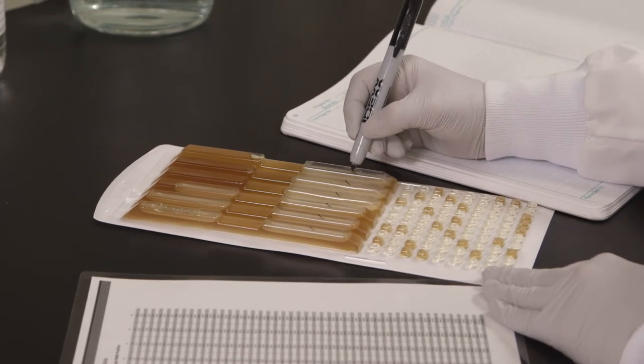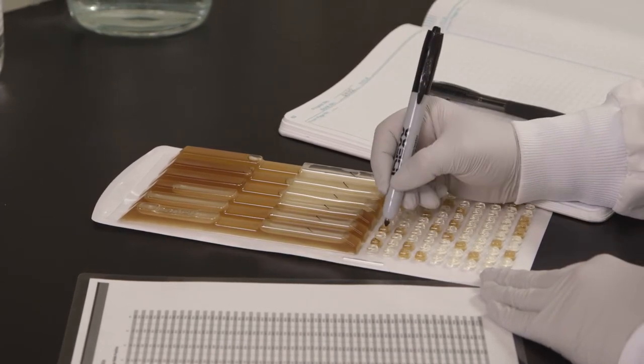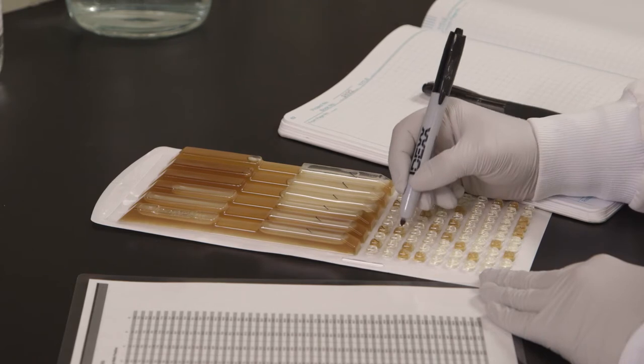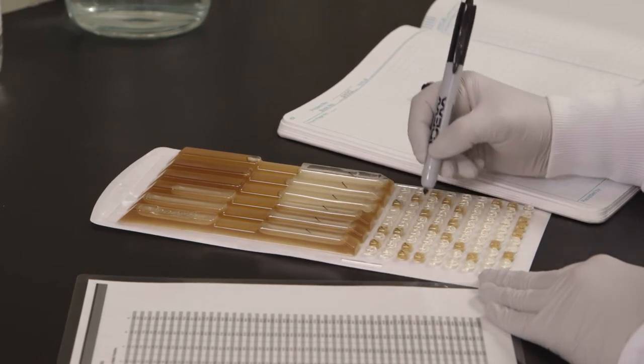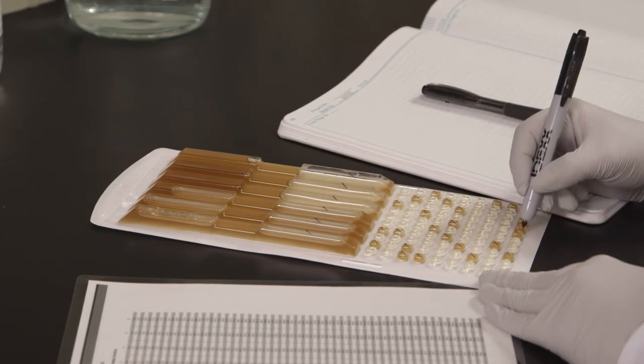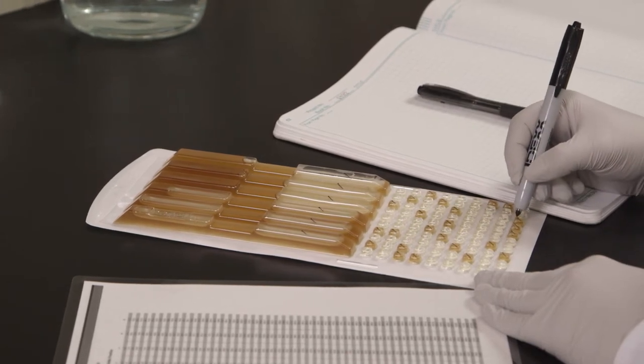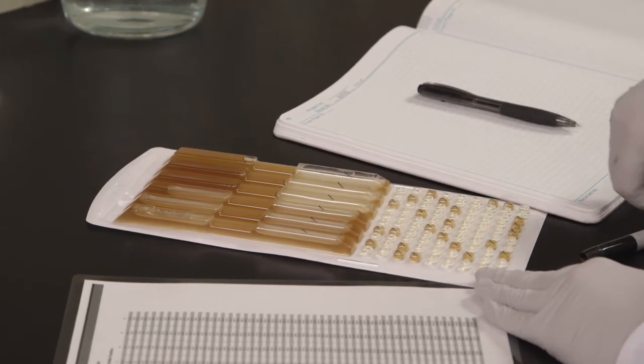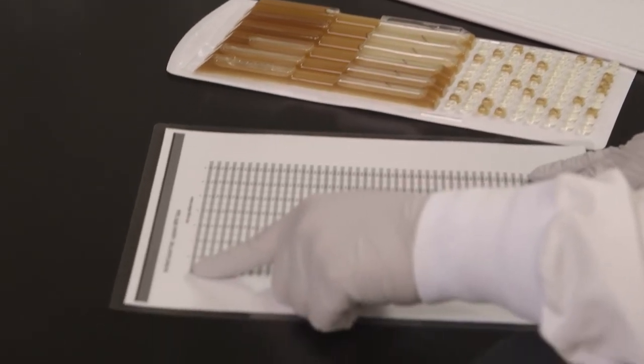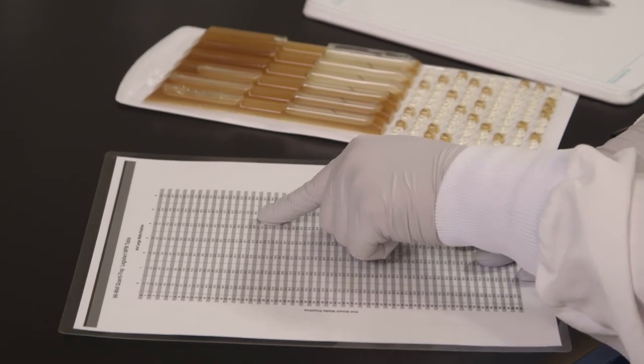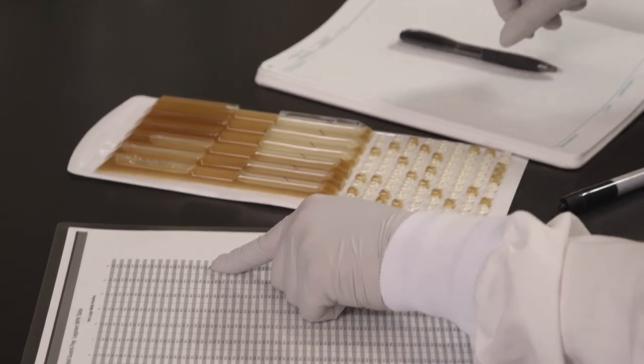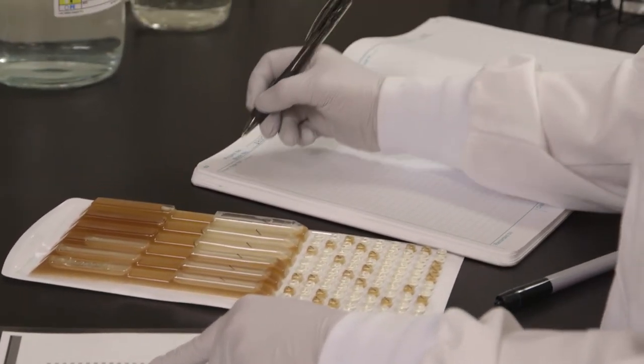After incubation, look for any indication of brown color and or turbidity greater than the negative control, which indicates a positive well. Mark each brown or turbid well. Count the marked wells, and then refer to the MPN table included with the Quantitray LEG-ALERT trays. The most probable number for this example is 156.6 per 100 ml.